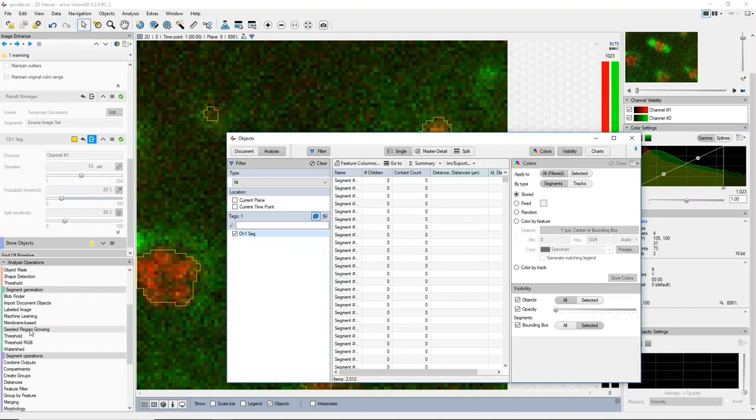And the region growing segmenter can help with this by allowing you to first work on the assumption that any nucleus is going to be the center of the cell. And so what you do is you grow from the boundary of the nucleus out until you find something that looks like it's a membrane. And it can be a lot faster and a lot more efficient. And if you have uneven illumination or uneven dye distribution, it's absolutely brilliant. I'm going to show you that later.